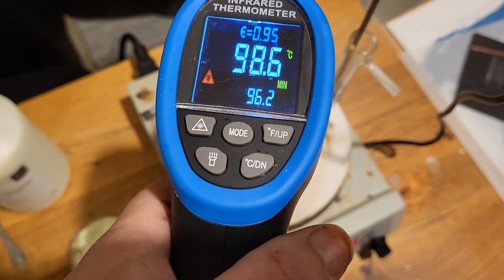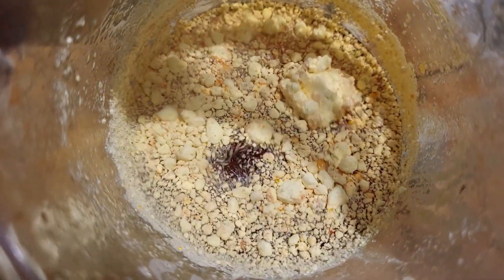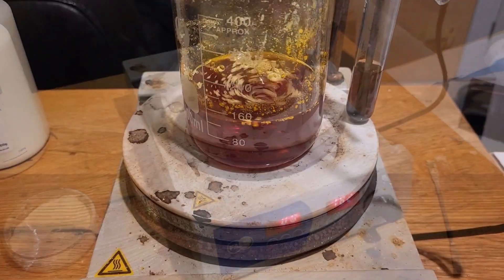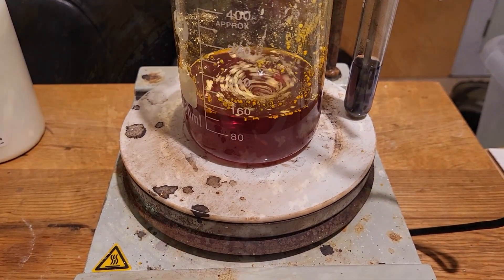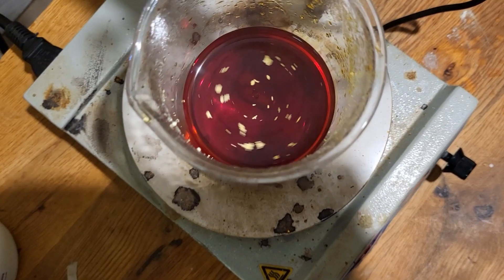There we go. The sulfur has been added. Just waiting for the last bit to dissolve. Close enough.